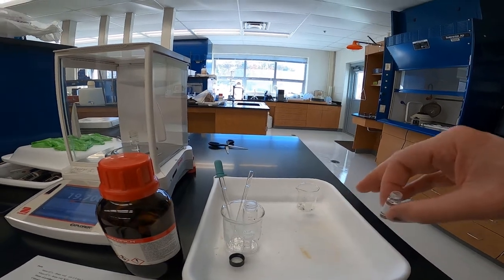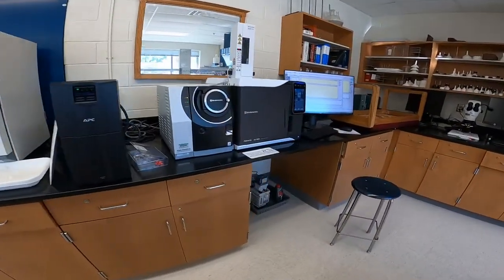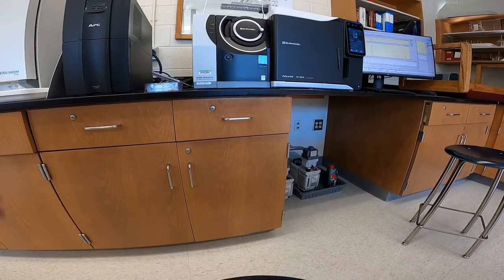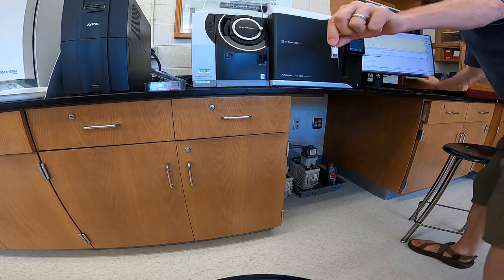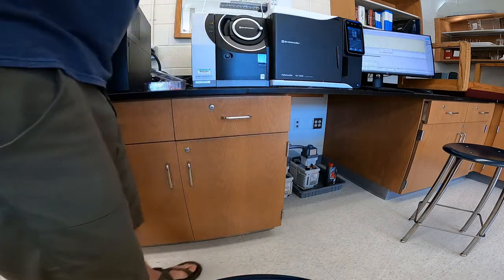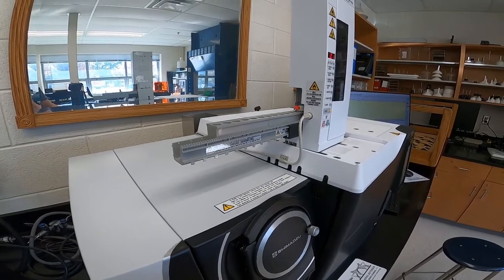So now we'll go over to the mass spectrometer, and I'll show you more about that and get a sample going. So here's our mass spectrometer, and the last step to do the sample prep, I need to put a cap on my capillary vial. So the mass spectrometer, here's the capped vial. It has an auto sampler.